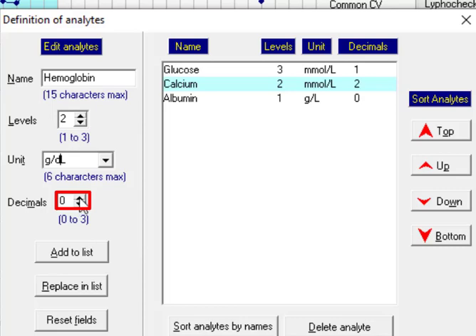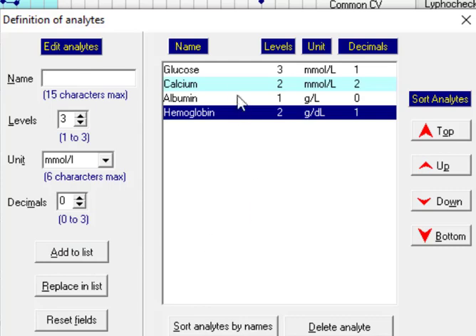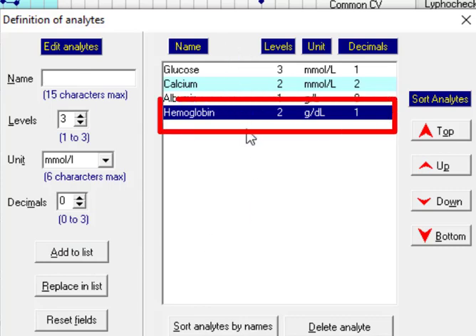The next one is decimal, the number of decimals. The maximum is three but we put one decimal for this analyte. And now we press the add to list button and it comes here. Hemoglobin, two levels of control, unit is gram per deciliter and number of decimals is one.